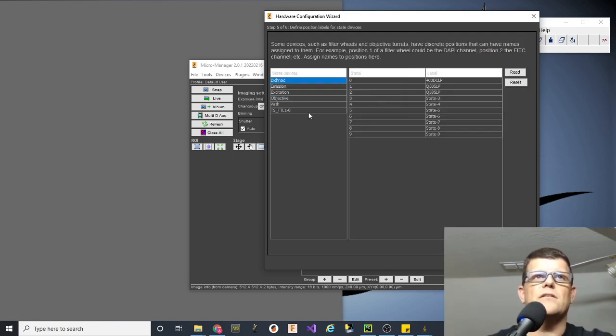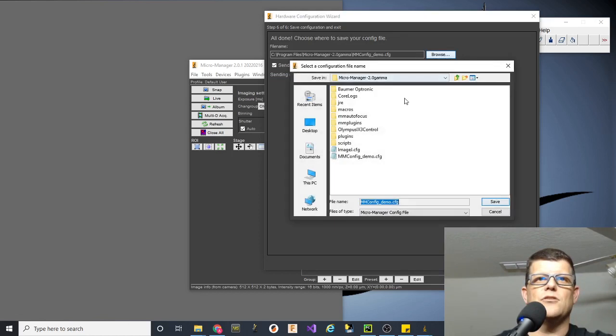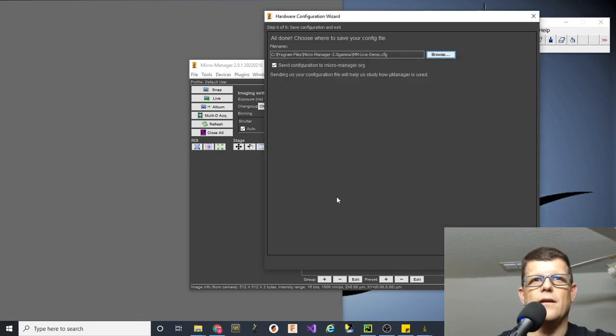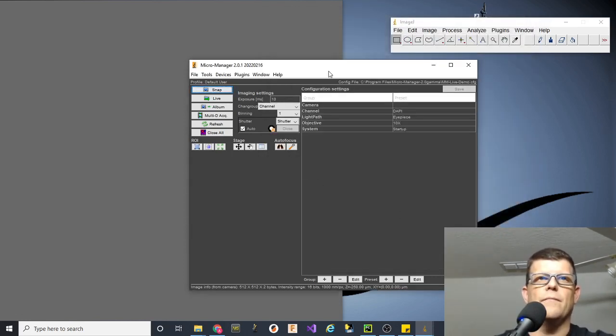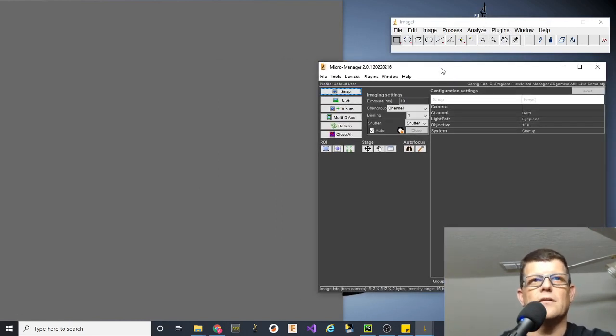All right, these settings don't need to be adjusted right now. We'll go ahead and update that. And then here what I'm going to do is just choose a new name, maybe MM Live Demo or something. Nice thing about these files, you can make a ton of these. If you send the configuration info to micromanager.org, it helps them keep up to date with what people are using in terms of drivers and do debugging and stuff like that.